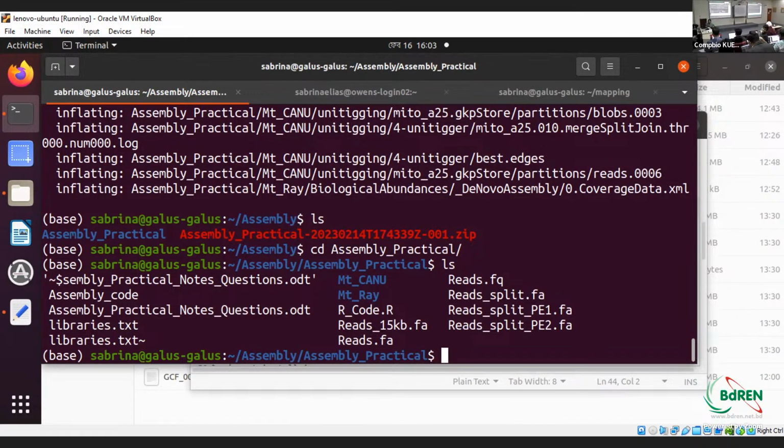This is actually from a mitochondrial genome, and we can try constructing the genome from this by doing assembly using the split.fa. So actually what I can do is upload only the read split file.